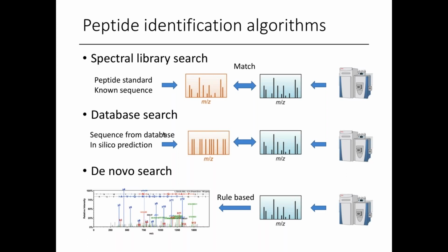Although there are efforts toward this end, like the Human Peptide Atlas program, which tries to obtain a consensus of the most abundant peptides and get a good spectral library, there are still problems. For species other than human, there's not enough data.